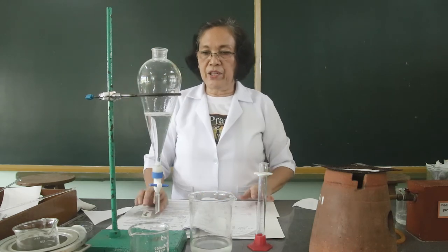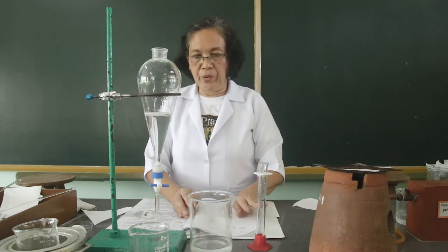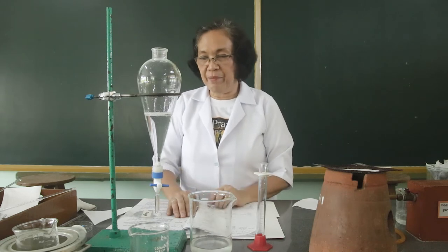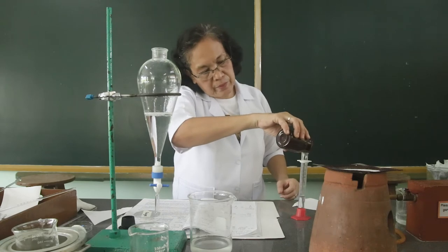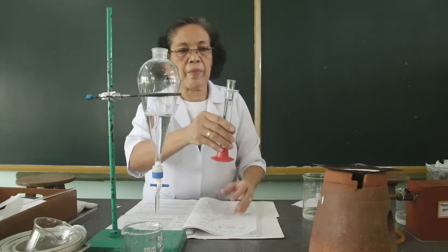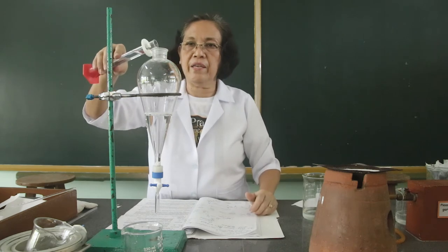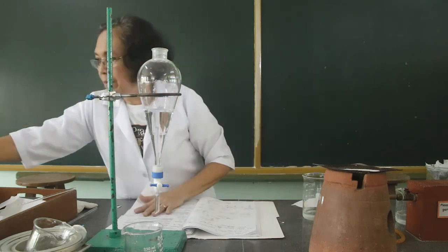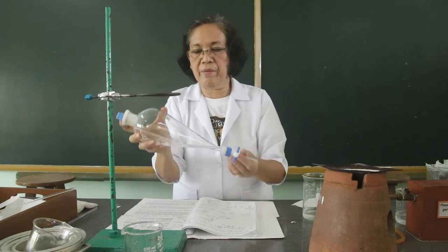Then we are going to add 25 ml of chloroform into the mixture of sugar and benzoic acid. This is to dissolve the benzoic acid. So this is the 25 ml of chloroform and I am going to add it here.